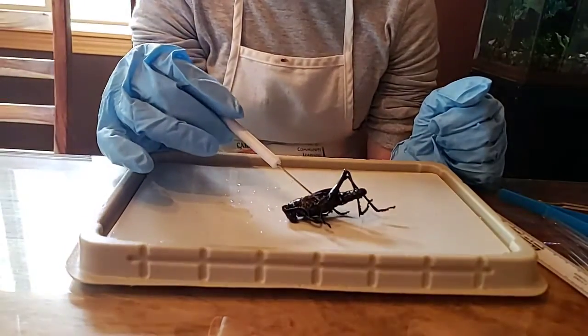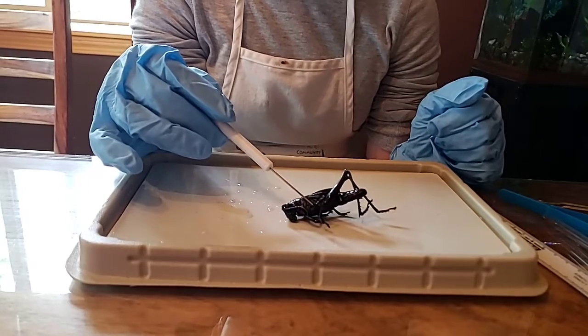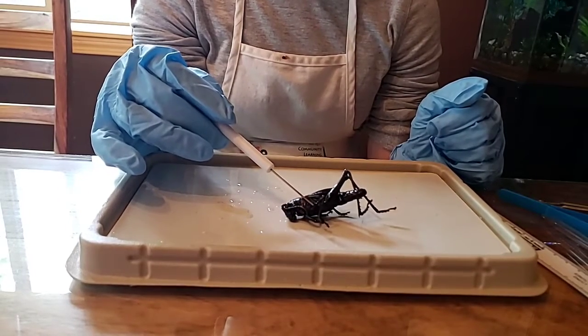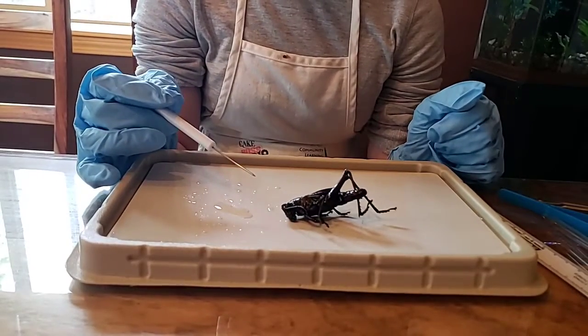So the first segment has how many legs? 2, one on either side. The second segment has? 2. 2, and the third segment has? 2. Okay?